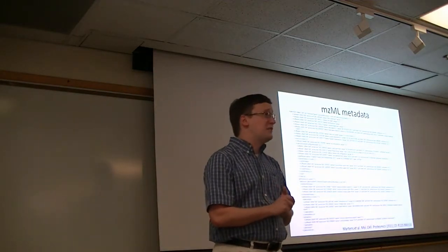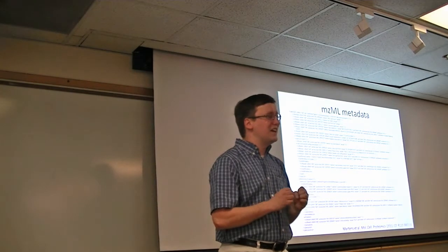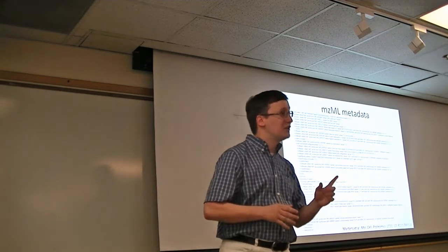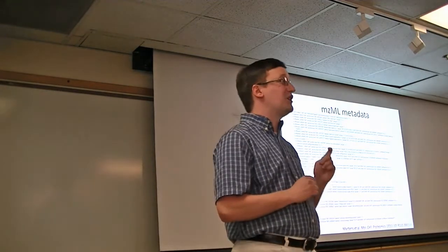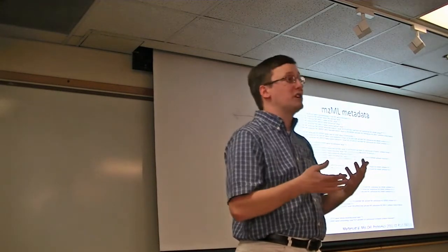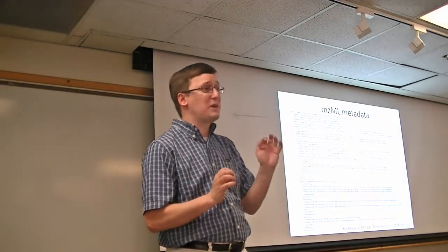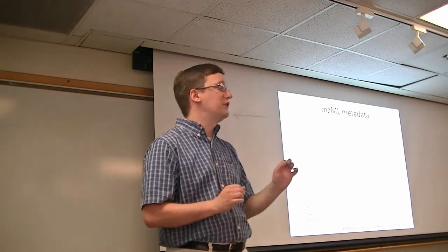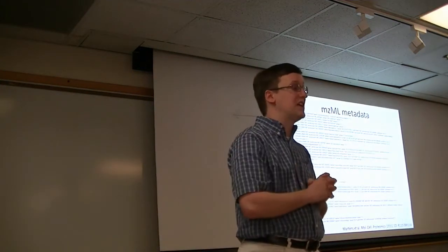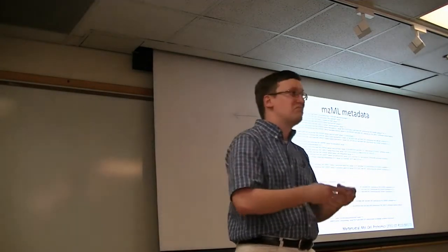The next thing I want to talk about for you is metadata. Metadata has kind of a bad name for a lot of people in proteomics because no one wants to enter it all. But the good news is that some metadata can be automatically generated. When we run an experiment on a Thermo instrument, we get a raw file that includes more than just spectral information. It will also include information like the isolation width for producing tandem mass spectra. It will also include the ion injection times, things like that.